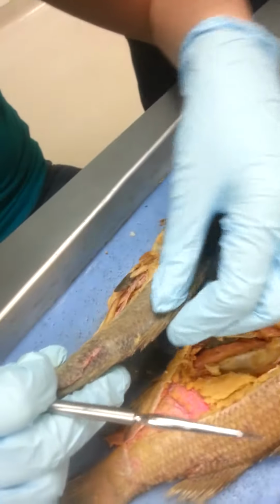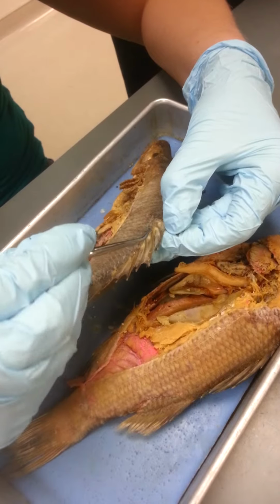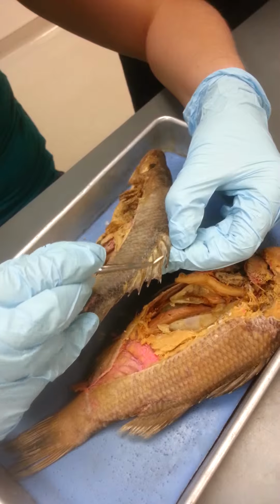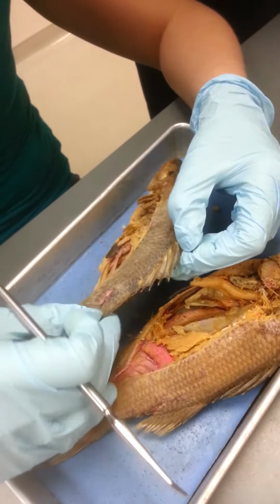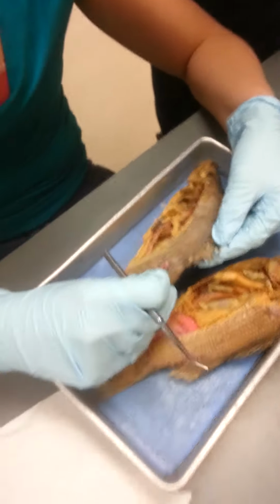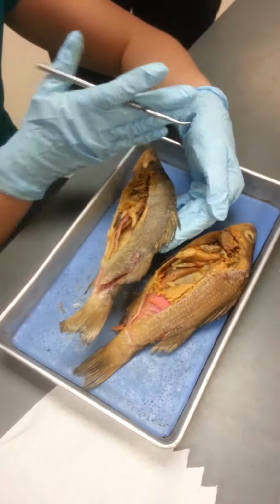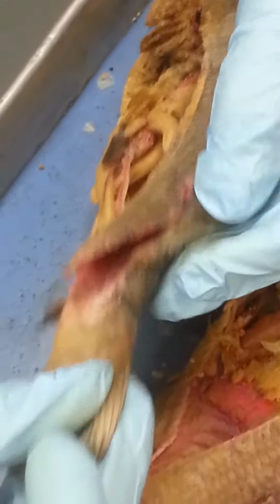So externally, what's this one? Spinous dorsal fin, and that's supported by actinotrichia. Okay, actinotrichia. And then we have the soft dorsal fin, and that's supported by lepidotrichia. Okay, so I remember that it just kind of goes alphabetically from the head to the tail, so A to L. Yeah. Those are kind of similar names. You gotta kind of think of something to remember which one goes with which.